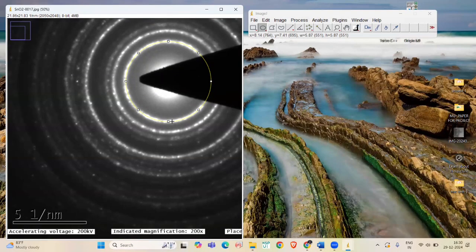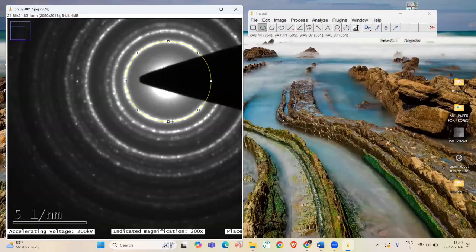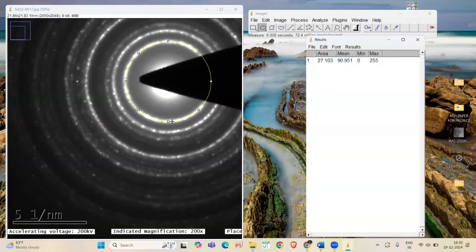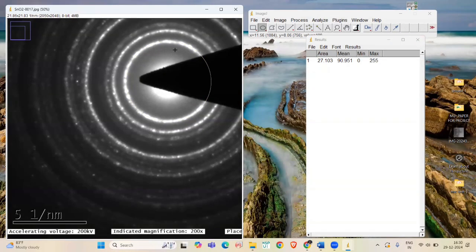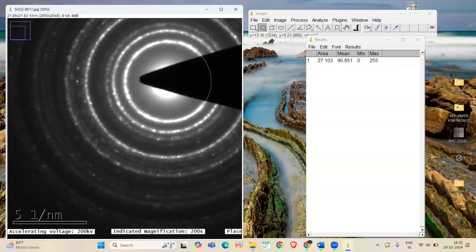Now, press Ctrl M to measure the area of the ring and press Ctrl D to draw over the ring for reference. Repeat this process for continuous 4 to 6 rings.